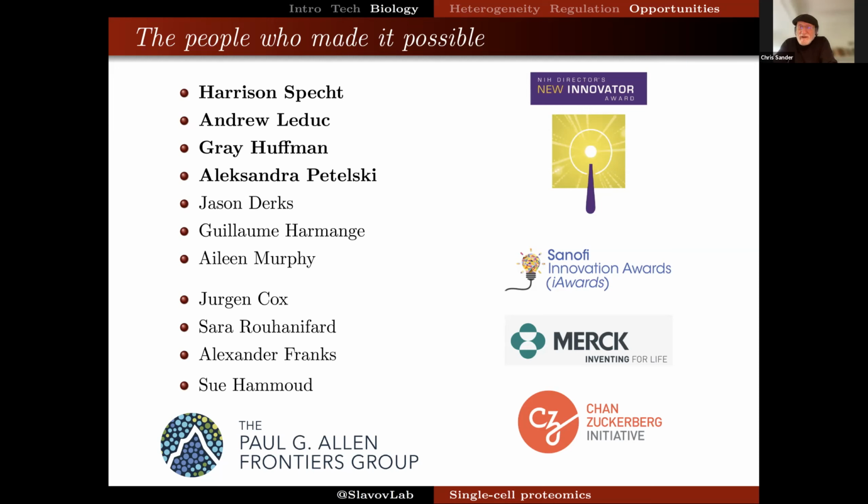I have a quick question, if I may. This is Chris Sander. Impressive progress. I just wonder, in terms of phosphopeptides, what's the current limit in terms of the number of cells that would be needed? I imagine not single cell, to see phosphopeptides with some reliability.